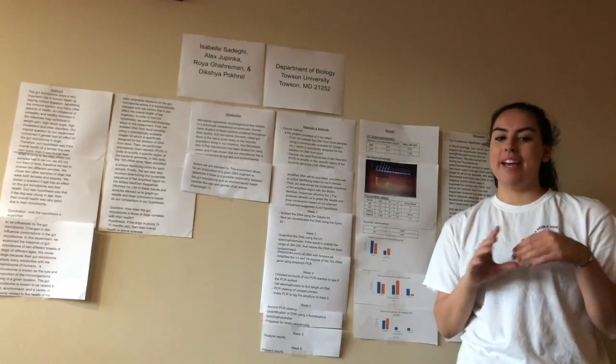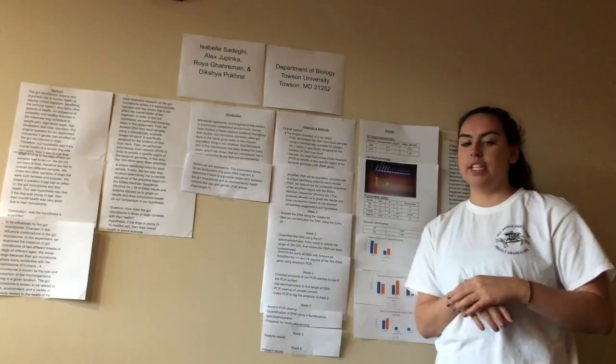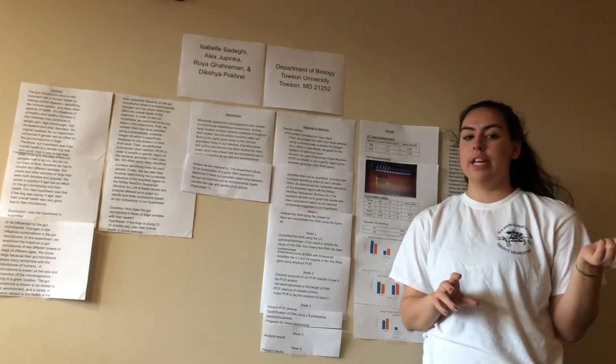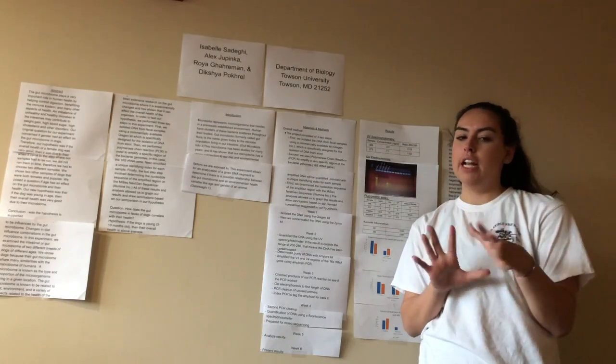Bacteroides is a genus that we found in both of our animal subjects, in different orders. Sample 343 had Bacteroidaceae at 20%, and sample 307 had the same bacteria at about 30%.